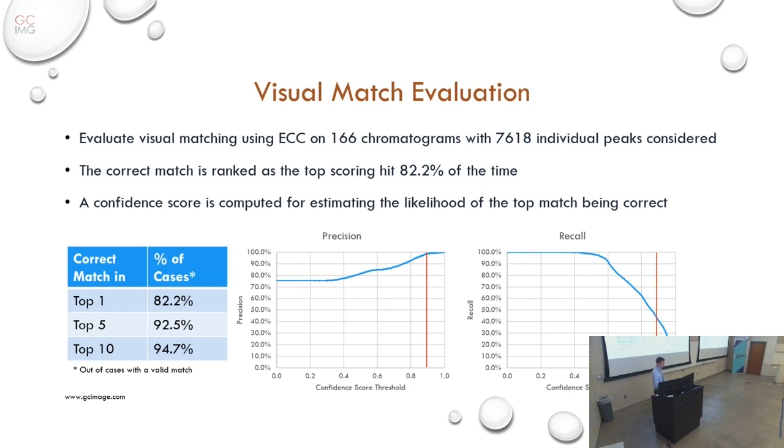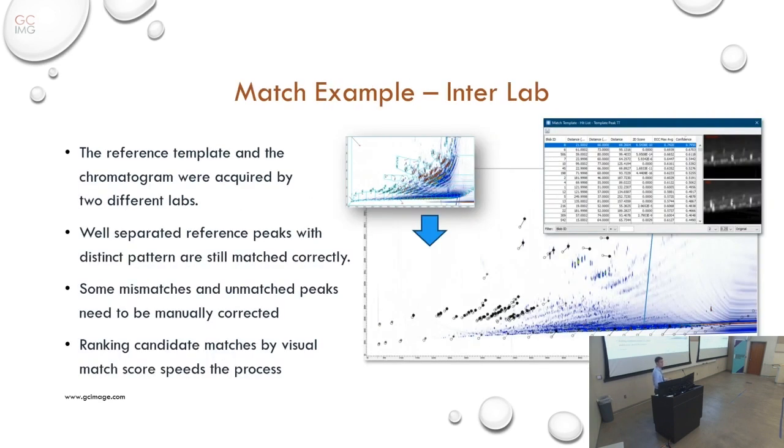But more importantly, it's important to note that we don't need this to get 100% accuracy, because this is operating purely visually. It's not accounting for the retention time, location, or distance between the peaks. There are peaks that this just isn't going to work for.